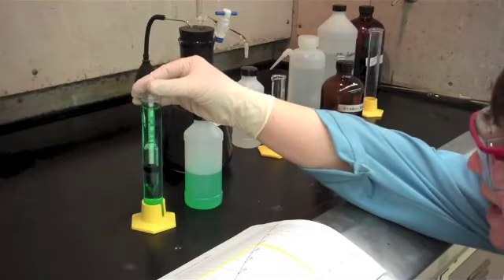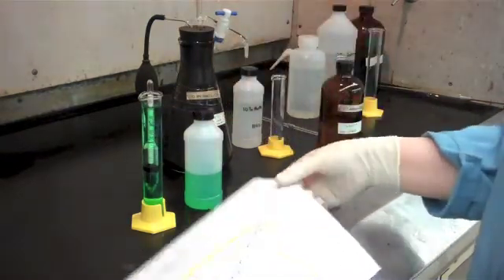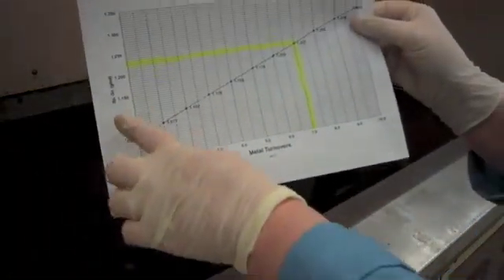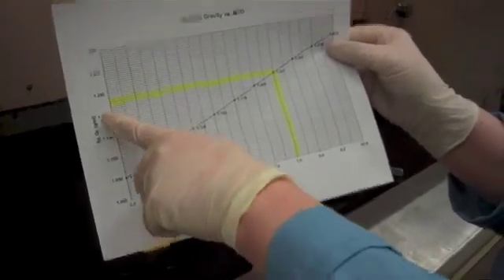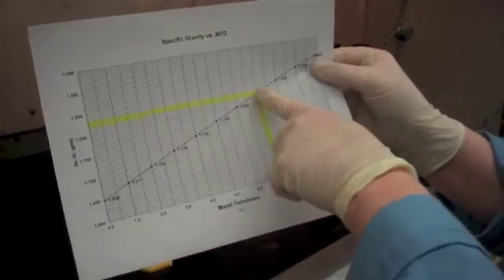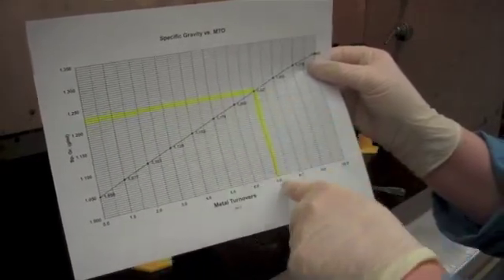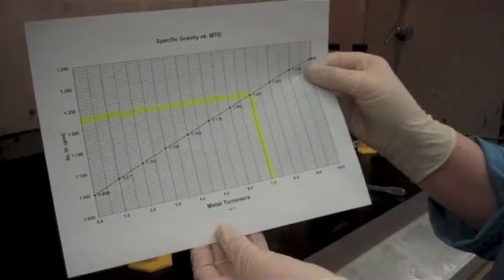For this bath, I'm reading 1.230 grams per milliliter. We have a graph comparing specific gravity to metal turnovers. And I've highlighted 1.230, follow the graph over to our line and down. This bath is at approximately 7 metal turnovers.